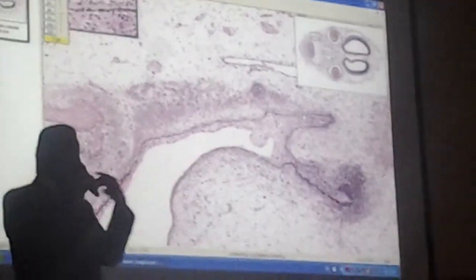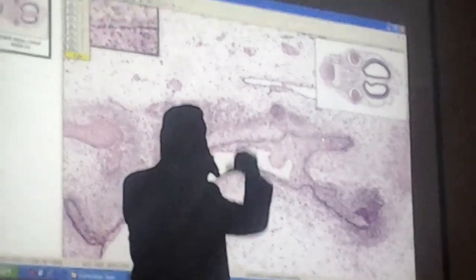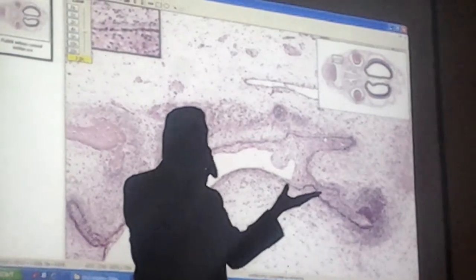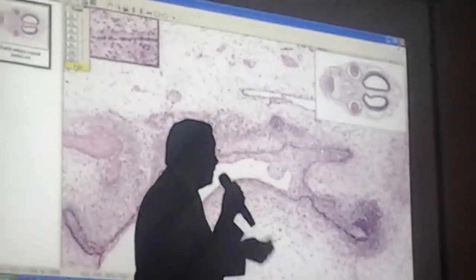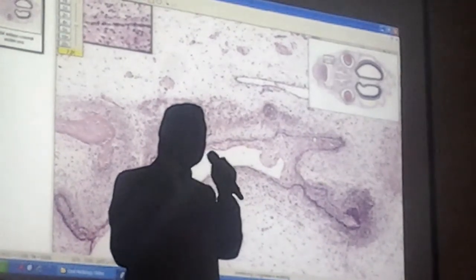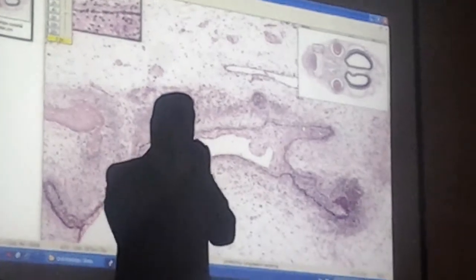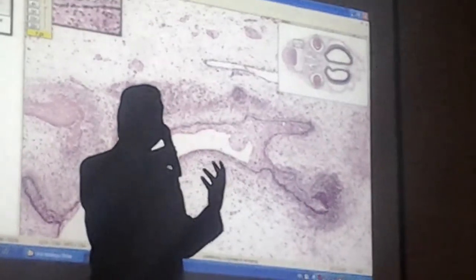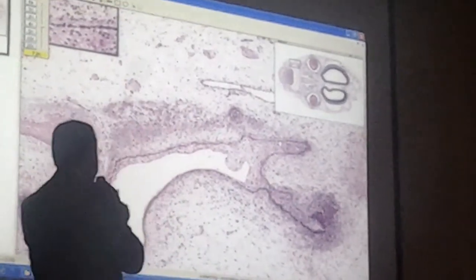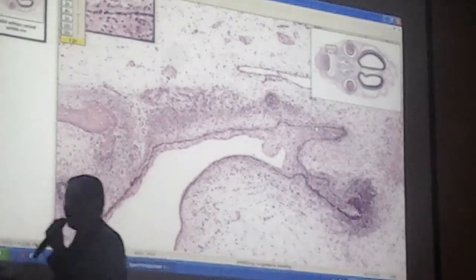The vestibular lamina has no reaction. The vestibular lamina is not going to interact with the ectomesenchyme. It is just going to be hollowed out, leaving a space. Isn't that the oral vestibule? That's why it is buccal. This is the lingual division, which is the dental lamina. There will be ectomesenchymal condensation. There is always a reaction because we have an interaction between ectoderm and mesoderm here, leading to tooth formation. So this is the vestibular lamina and the dental lamina. Okay.